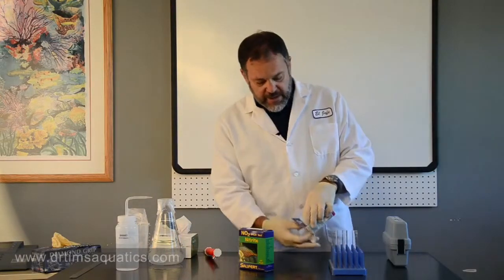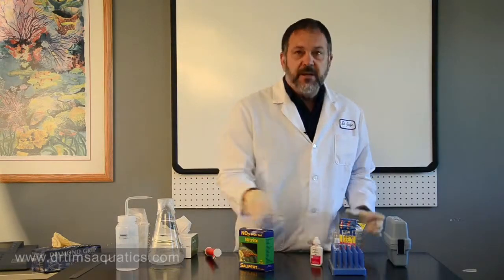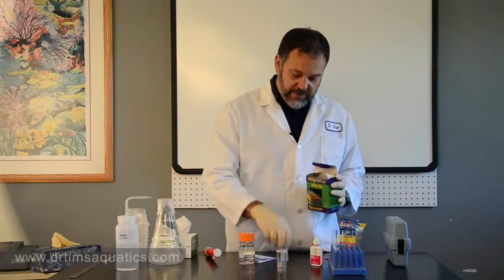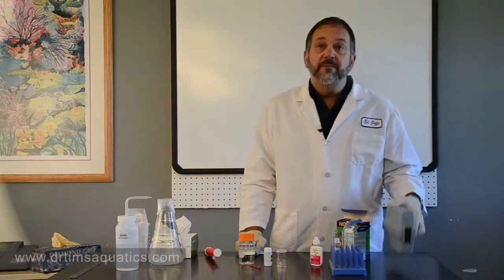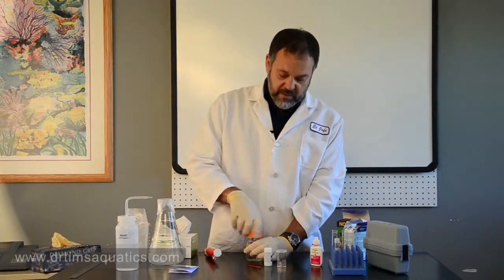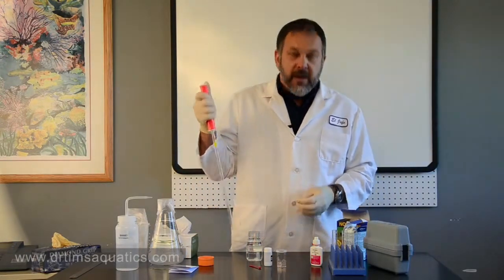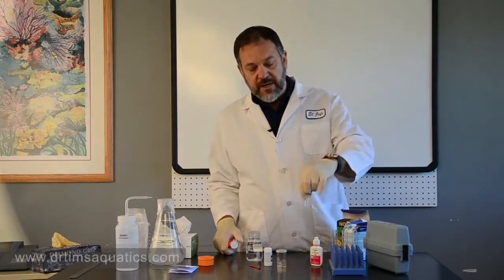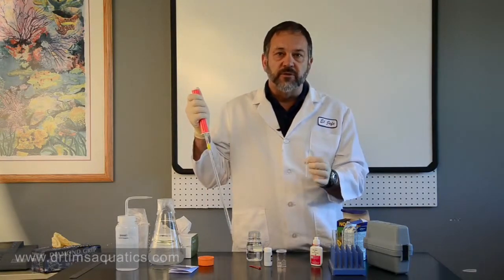So we open up. The Aquarium Farm kit uses drops — we fill up the vial to the line and add so many drops. The Salifert test kit is powder; you have a vial, some powder, and a little scoop. As a comparison, I'm also going to use a HAWC test kit, which is a higher standard and better quality than what's available to the hobbyist. I've prepared a sample so I can accurately measure everything out. When dipping test kits in your water, don't take water from the very surface — go into the tank below with the tube upside down, then turn it back up so it fills. That way you don't get any oils or scum from the surface.